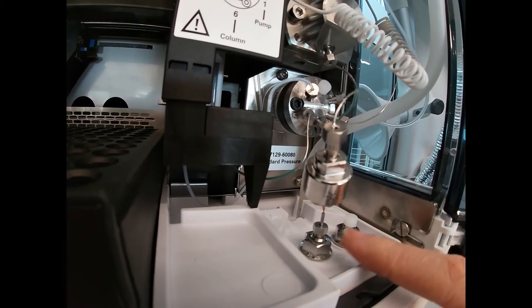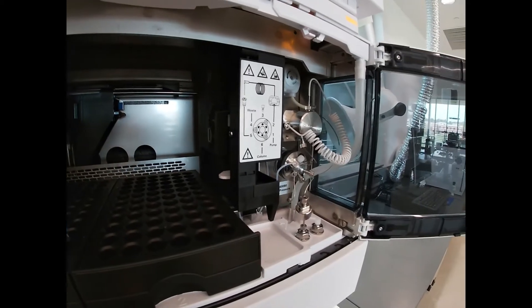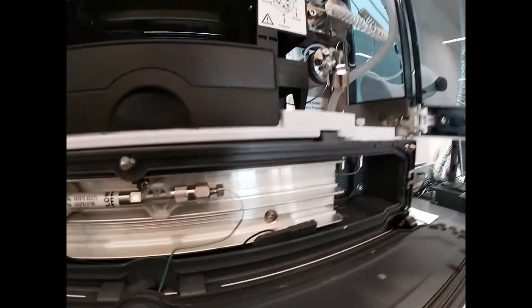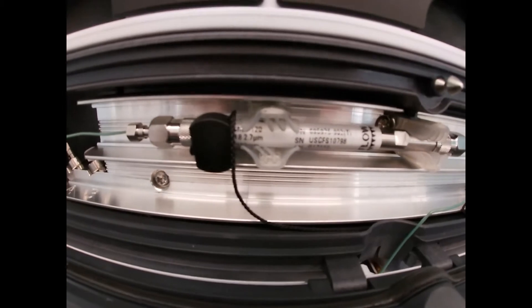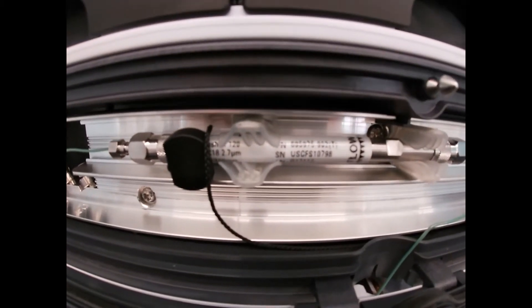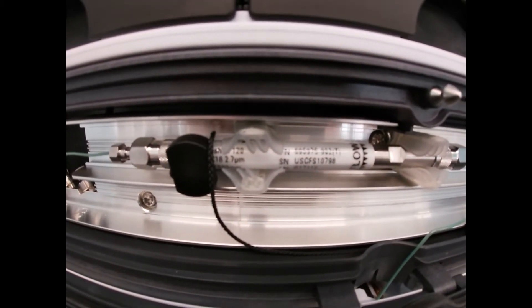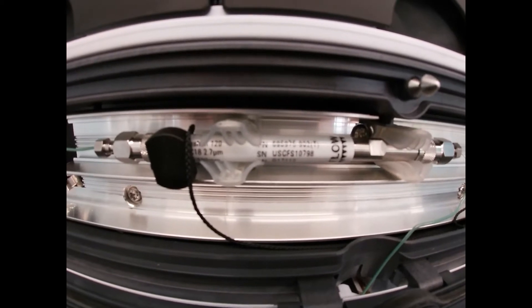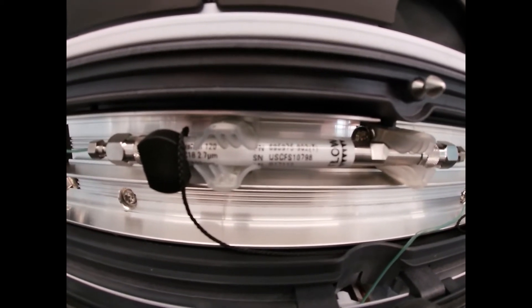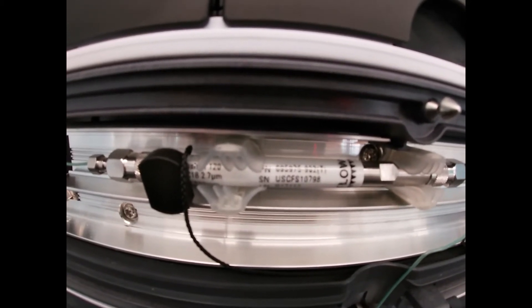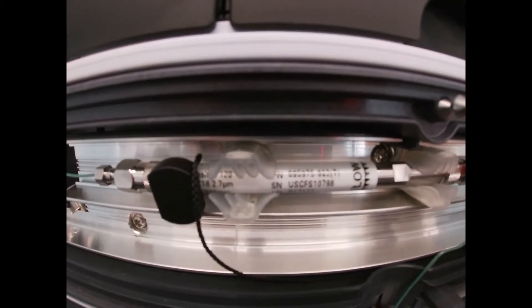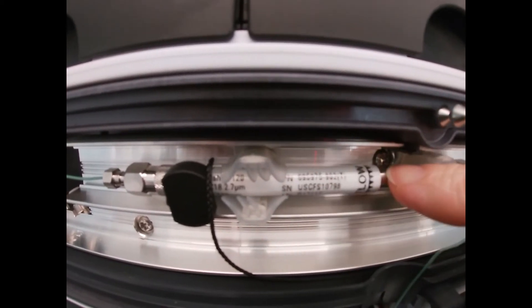We pass through this filter and then we enter our column. The column, you'll notice, is encased in stainless steel, and that's because we're using high pressure liquid chromatography. Those pressures reach about hundreds of bar so we can pass through our column.